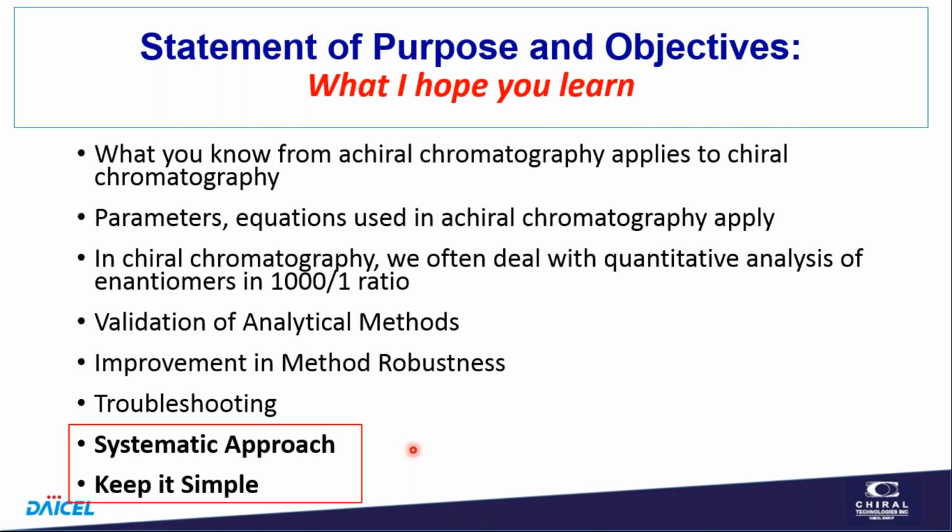I sometimes deal with people who have a problem with their method, and they have maybe a complicated mobile phase, and I'll ask them about the different components, and they don't always know why they have those components in there, but the answer has come back a number of times: well, that's the conditions we were using when we found a separation at work. So oftentimes we don't need to use complicated mobile phases or complicated separation conditions. We want to keep the method simple. The simpler it is, the fewer components there are to have a problem or to go wrong. So the robustness of the method is generally better if you have a simple method.